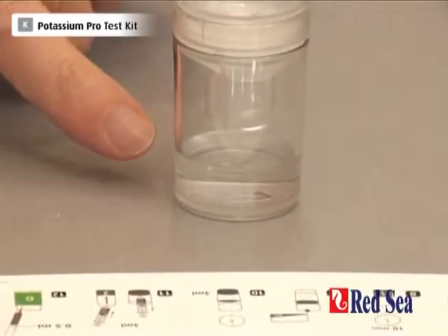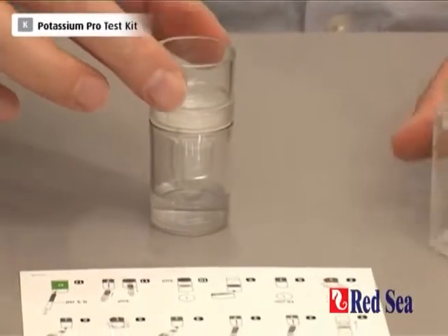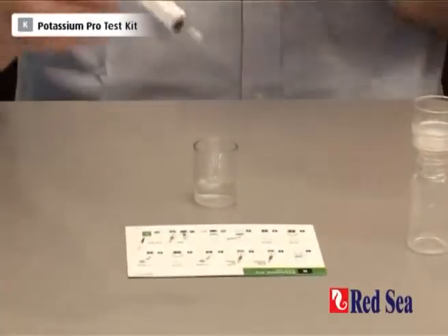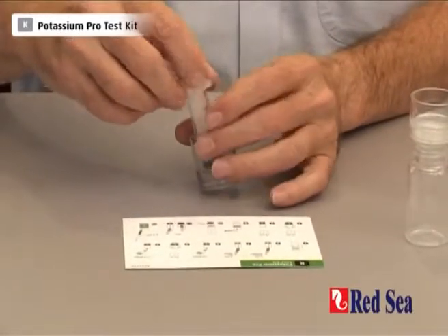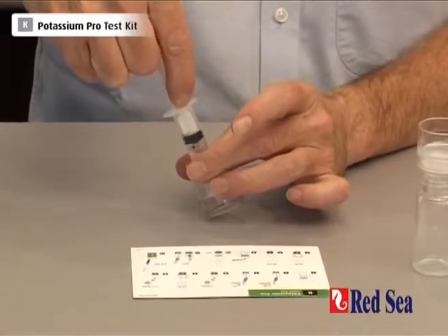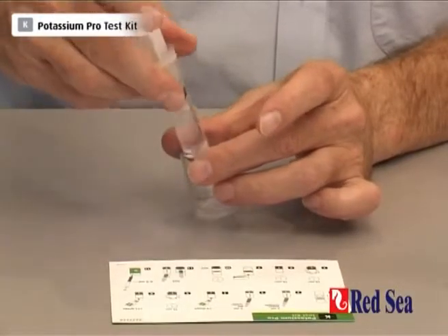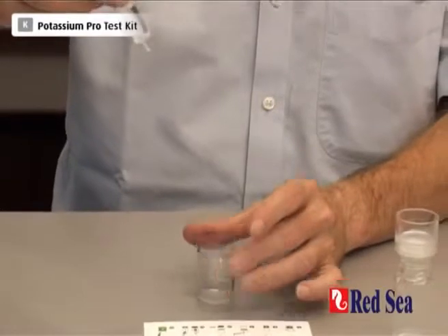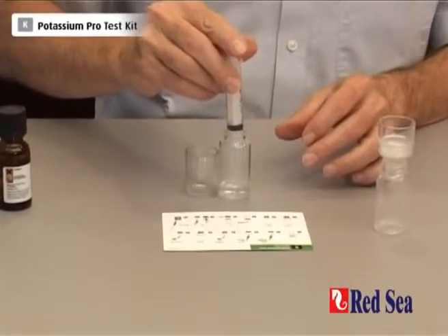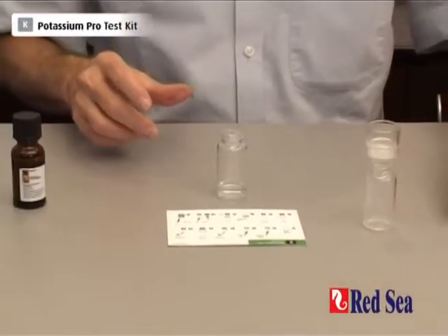We can now see that we have filtered more liquid than the line on the bottom of the cup, so we have at least the 3ml that we need. We can dispose of the remainder. With our 5ml syringe, we take out exactly 3ml of fluid and put the 3ml into a new vial, which we're going to use for the rest of our test.